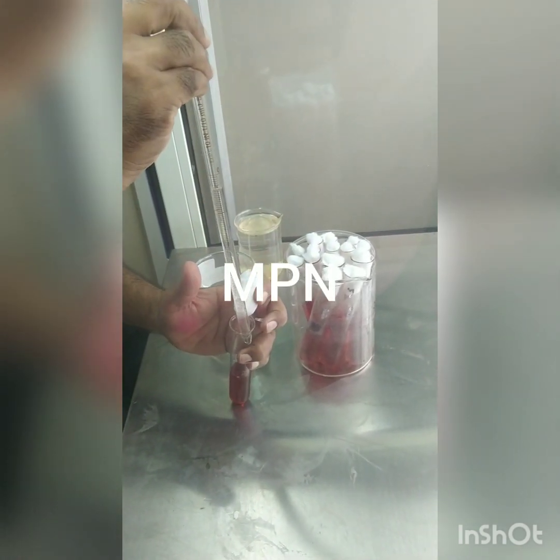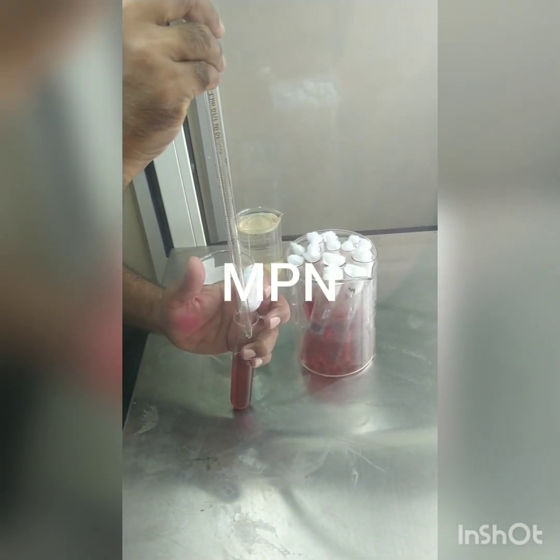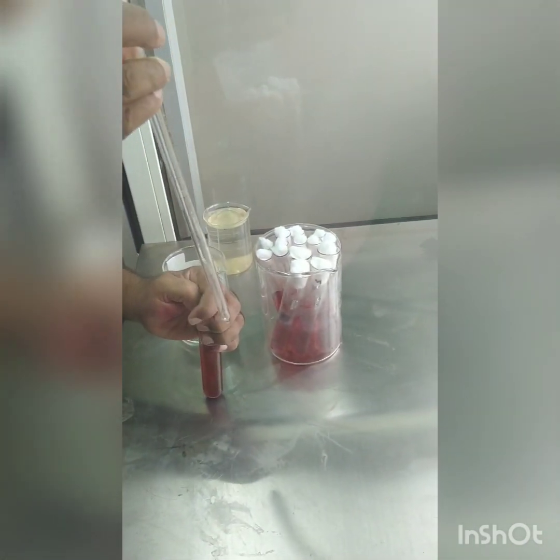Now we are starting with the filling of the sample into the sterilized tubes. In set A we have to put 10 ml of the sample. We are going to show one tube from each category: 10 ml in set A, 1 ml in set B, and 0.1 ml in set C. All the tubes will be filled like this for sample one as well as sample two, and then they will be put in the incubator.